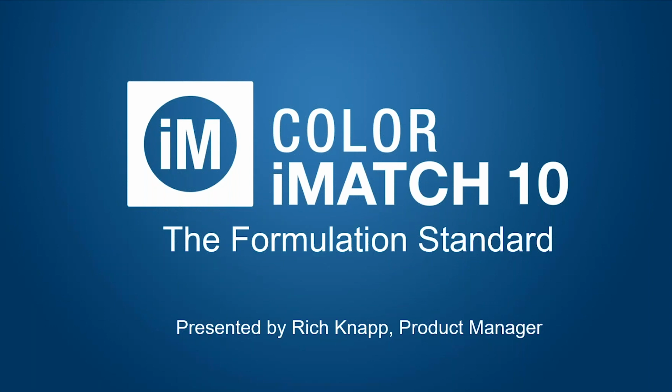All right, hello everyone, and thank you for joining us today. As Robert stated, what we'd like to review with you today is a new release of Color iMatch. Color iMatch is X-Rite's industrial formulation product. It supports plastics, coatings, and textiles. As I go through the presentation today, I'll be talking about each of those segments. But the focus again is on the major new release, which is version 10. We've added significant new capabilities and features to the product that will both improve performance as well as streamline customer workflows.